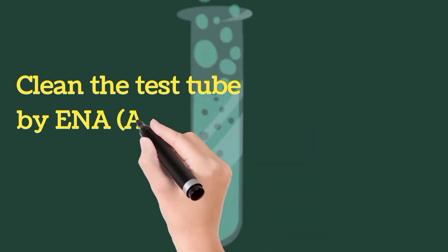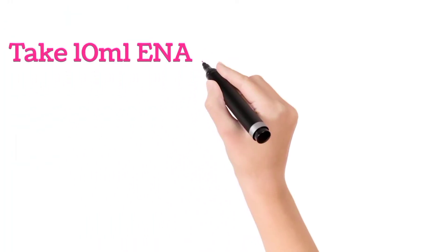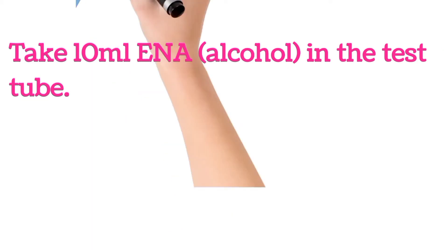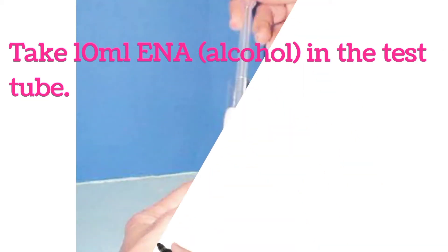Clean the test tube with ENA alcohol sample. Take 10 ml ENA alcohol in the test tube.